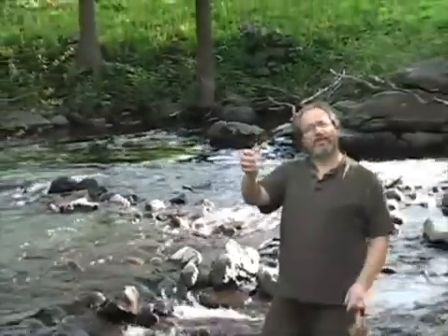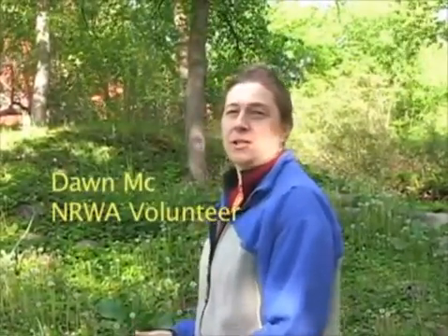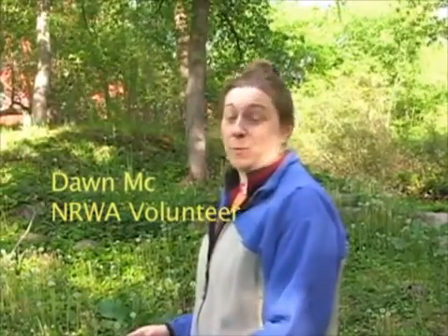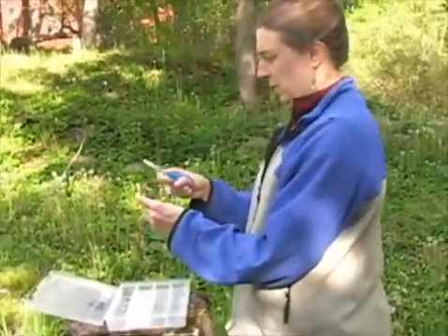We'll add some reagents here on site before we head back to the lab. Oh, I get to add reagents for dissolved oxygen. There's a packet for number 1. There's a packet for number 2. Those go in right as soon as you take the sample out of the water and get shaken up. Take it back to the lab and add the 3rd reagent, and then it's ready for further testing. So I'm going to add 1 and 2 right here by the stream. Each reagent comes with its own little labeled packet, 1 and 2.